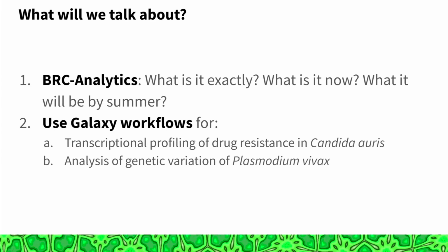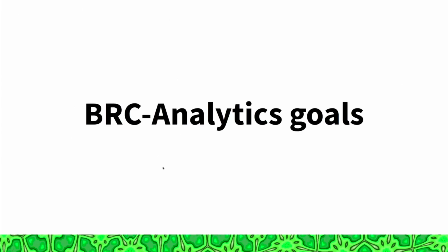One will be dealing with analysis of transcriptome contrasting drug-resistant and drug-susceptible strains in Candida auris. Another one will be dealing with large-scale surveillance of variants in Plasmodium vivax using a public data set. So let's start with BRC Analytics.